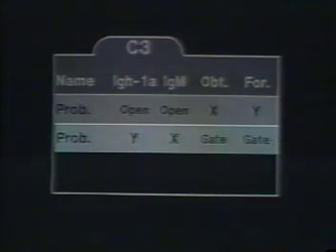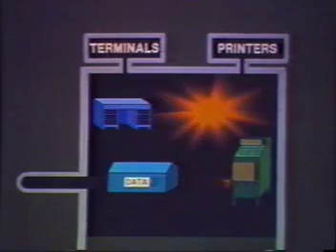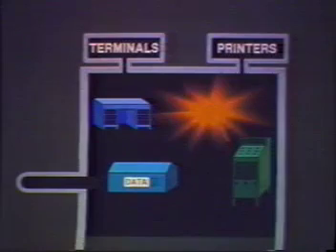Once Tom has placed requests for all of the analyses he needs, he closes his analysis drawer, exits the FACS desk system, and leaves the Magic Secretary to submit his jobs to the analysis machine. The Secretary then arranges for a copy of the data from each sample to be sent from the warehouse to the analysis machine. When the analysis machine has processed all the data for a sample, it sends the results to the Magic Secretary. The Secretary then routes the completed analysis to a printer or a video output system.